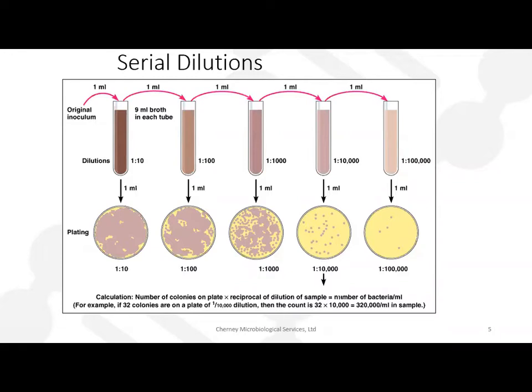We had a question come in. Someone had asked, is serial dilution something you sort of play with to find the ideal dilution? It's always better to start out with more dilutions than you think you need, and then get an idea of what's going to work best for you going forward. So it is something that you'll need to play with, but more dilutions is better than less, so you don't have to go back and set something up again.